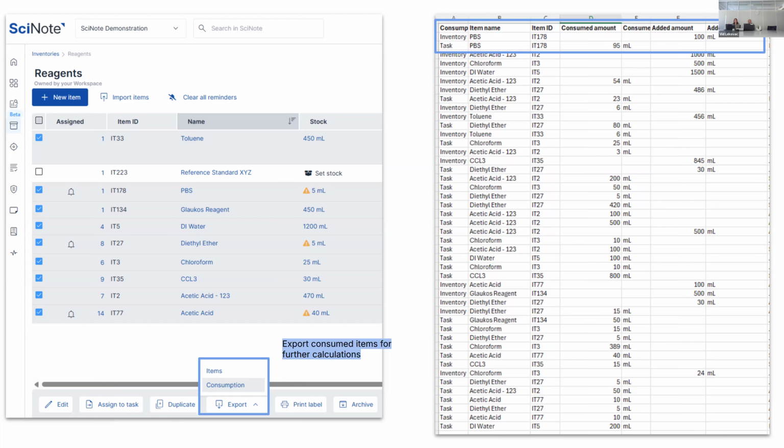Back to stock management. So that's what I mentioned when I started this topic. Keep in mind, keeping inventories up to date. Also, what we covered earlier, stock management is a big and important part. So stock consumption should be used to have inventories up to date.